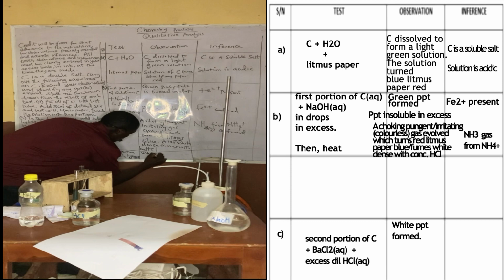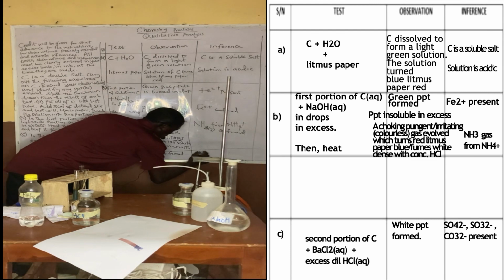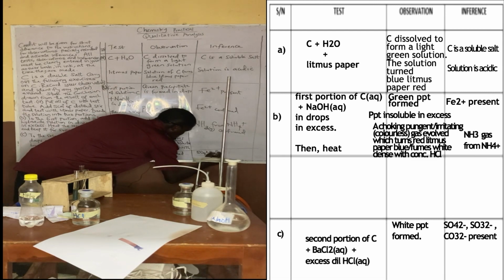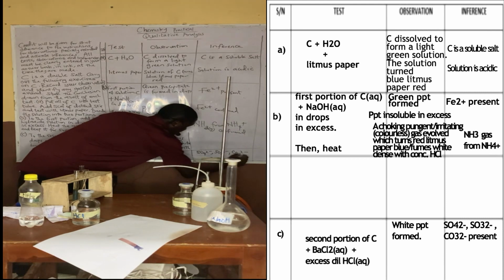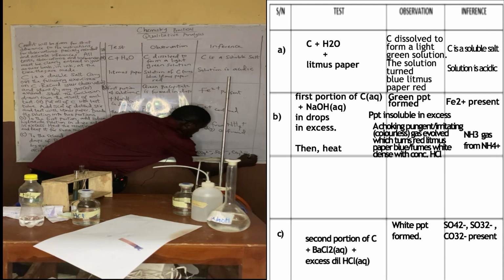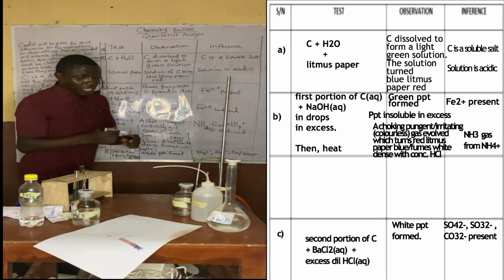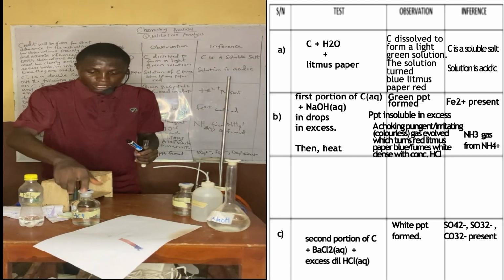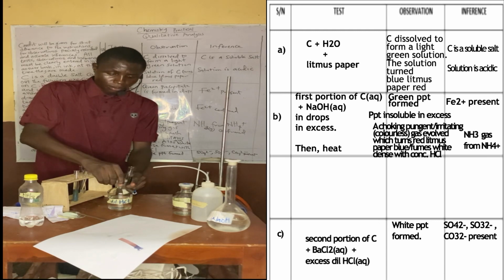A white precipitate formed. Now, what are the likely anions present? You have SO4 2-, SO3 2-, CO3 2- present. But when you add dilute HCl in excess, what happens?